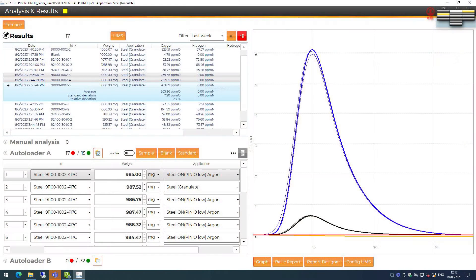The carousel is coated. Up to three carousels can be assigned to one analyzer. When the carousel is set up, the analyzer recognizes it and automatically selects the correct sample list.